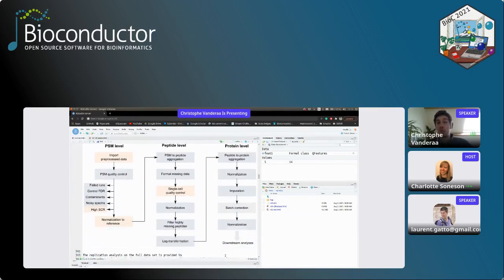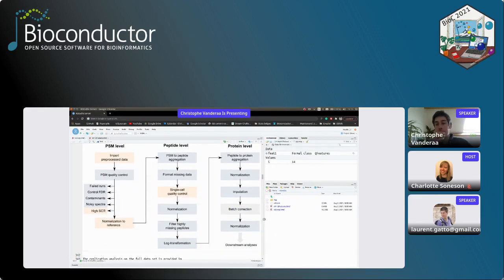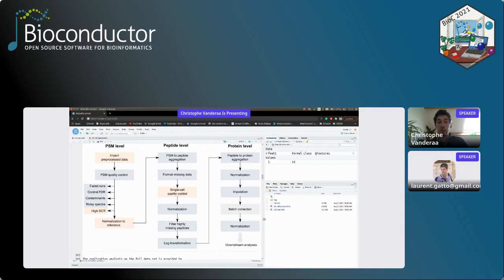So before we start, we are working with data that was acquired with the SCoPE2 technology. What we are going to do is try to reproduce part of the data analysis that the authors made. They provided some R script. They basically built everything from scratch. It was quite hard to read. The whole purpose of the paper was first to show that the technology worked. So we took the effort to standardize the script and show here that performing SCP processing is not that hard and doesn't require that much processing skill as long as you have the correct tools to do it.